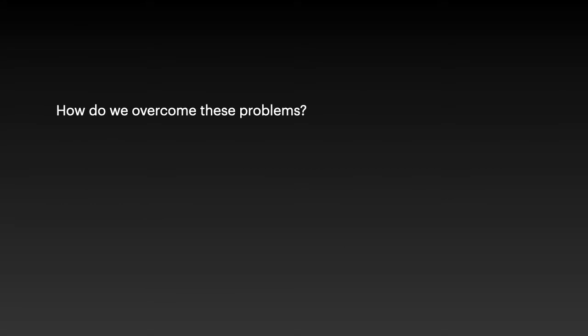So how do we overcome these problems? First, let's consider the low endogenous content problem. So samples are usually taken from museum collections, or ideally the case would be to take them straight from the excavation site and bring them to the lab.